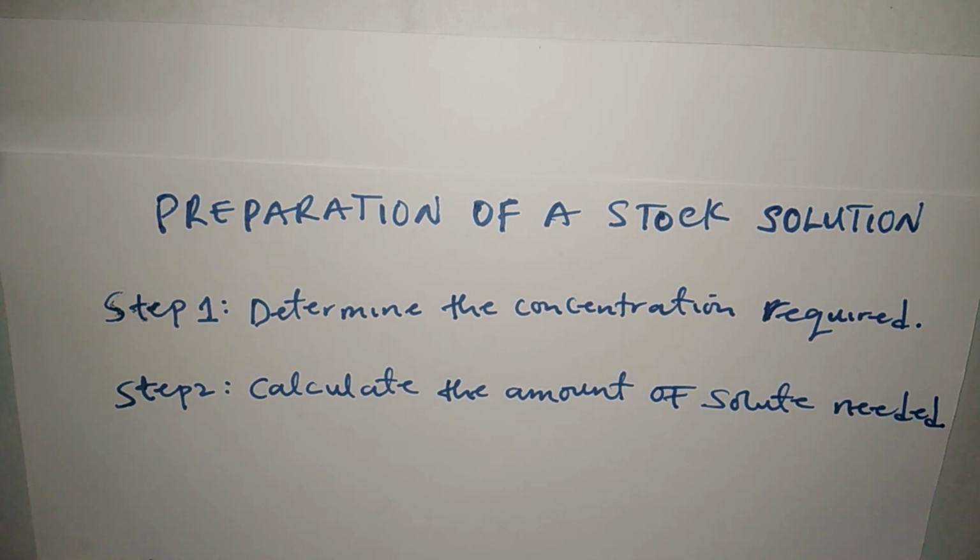In this video, we are going to be discussing the preparation of stock solution. A stock solution is a highly concentrated solution that is used to prepare more dilute solutions. It is important that you know how to prepare a stock solution correctly. Here are the steps that are involved in preparing a stock solution.